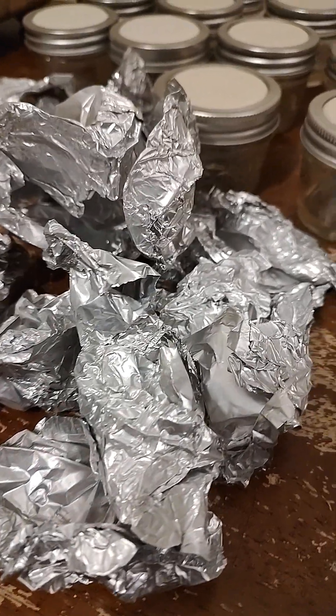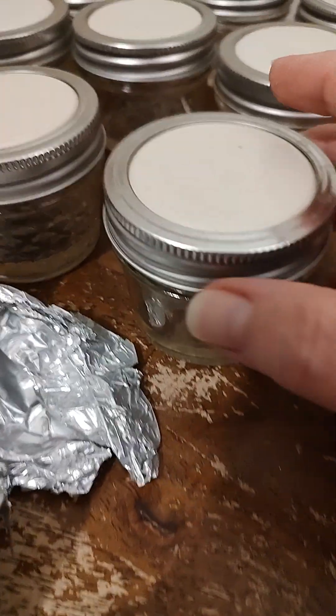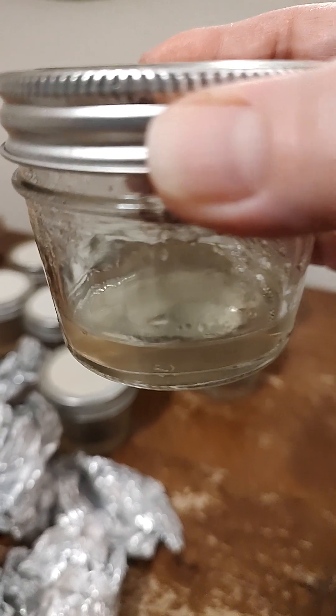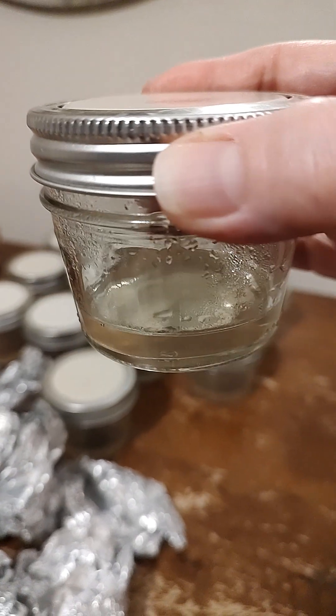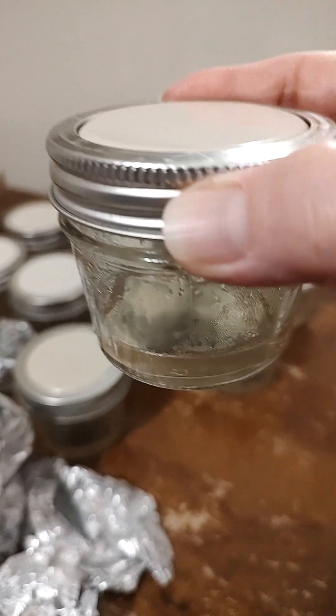Hello, friends. I just pulled these no-pour agar jars out of the pressure cooker. This is an incredibly light MEA recipe that we're going to use for cloning tasty mushrooms during the colder winter months.